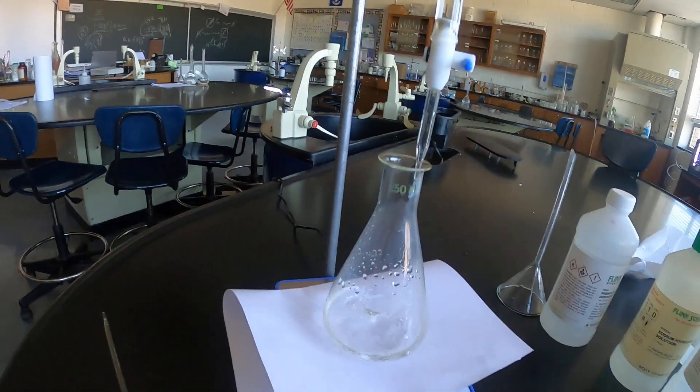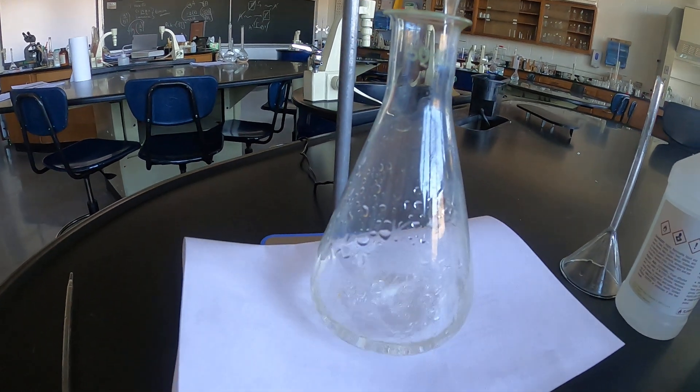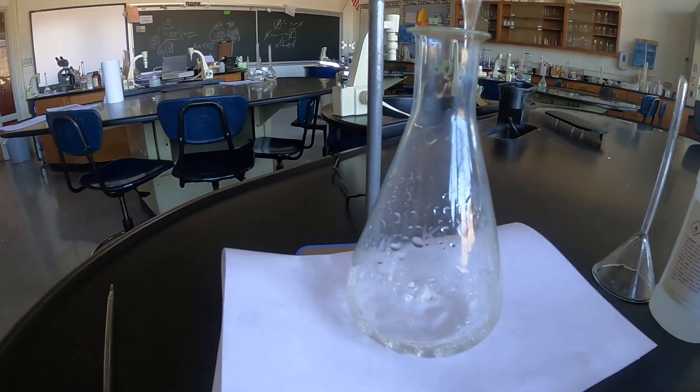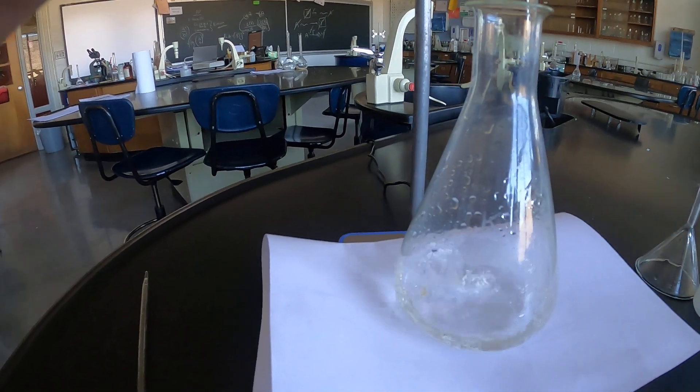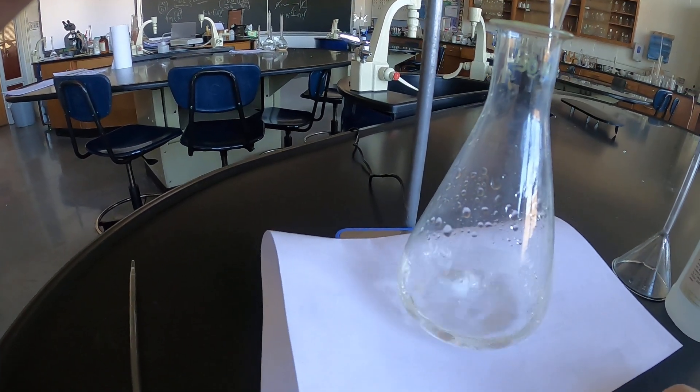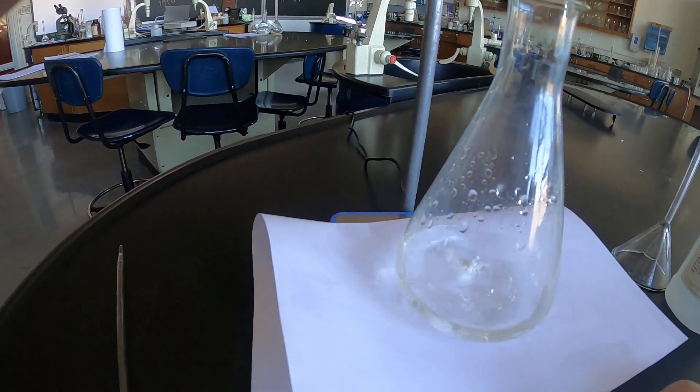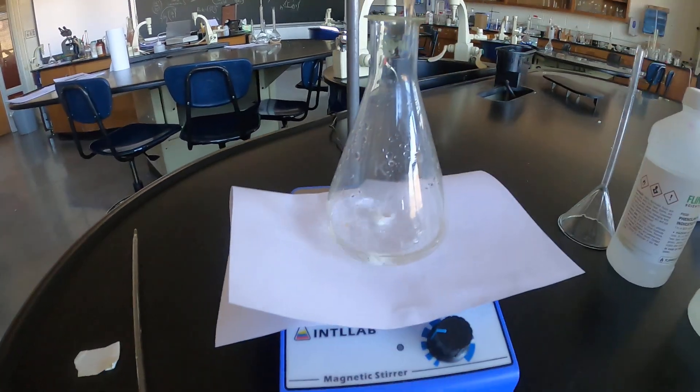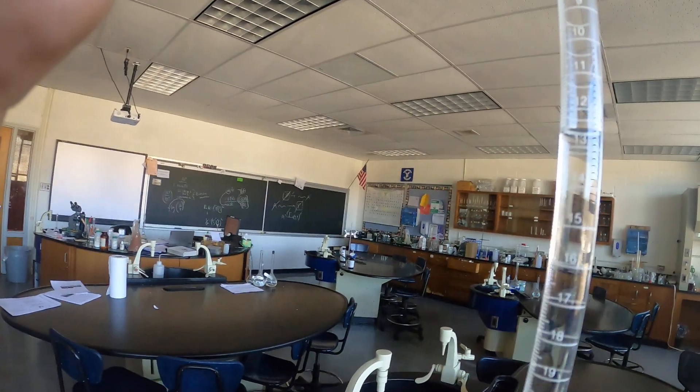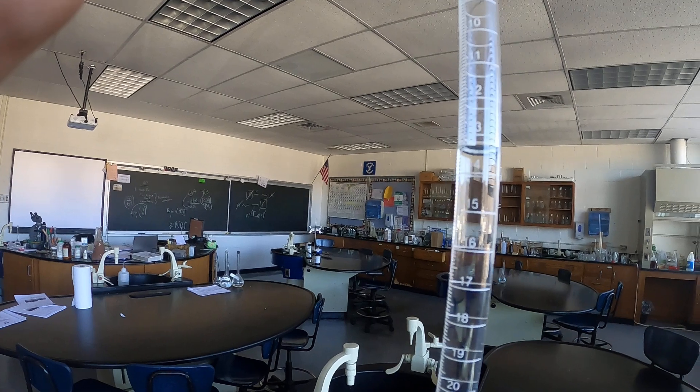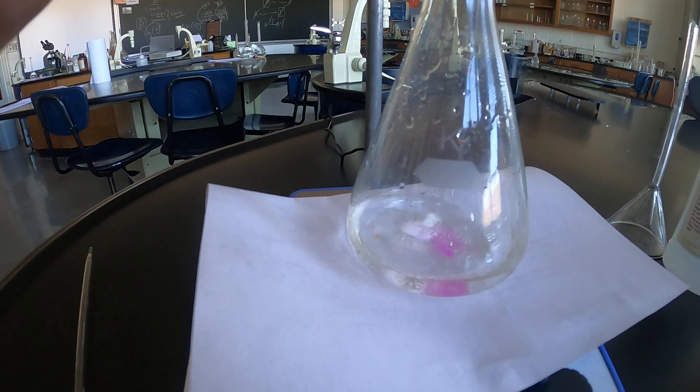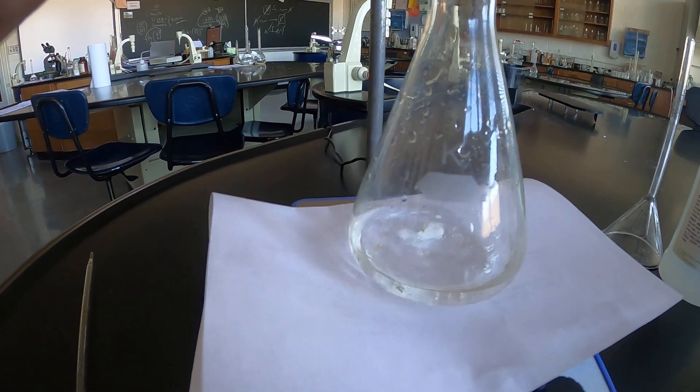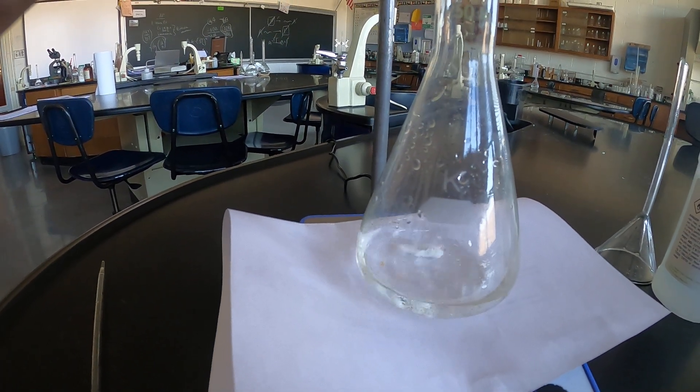I'm trying to titrate to again the endpoint or the equivalence point in this titration which is getting the solution to a pH of seven. And again that is indicated by a pink color in your analyte withstanding for more than 30 seconds. So let's turn my stir plate back on, let some more titrant out. I'm at 13, 14, 15. Notice the color, so it's standing longer. Good habit to turn it off, check for your color.